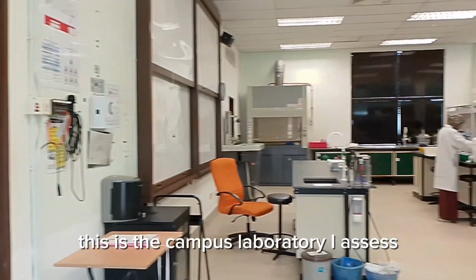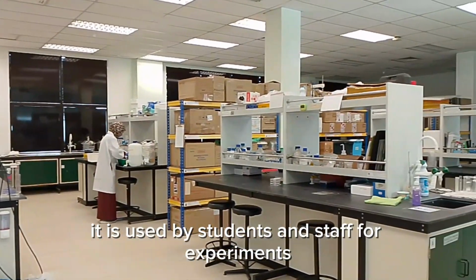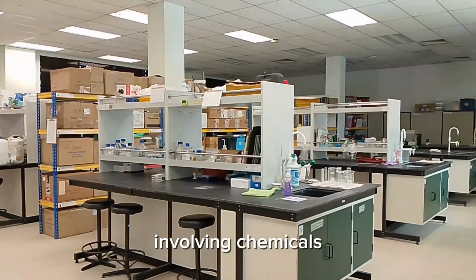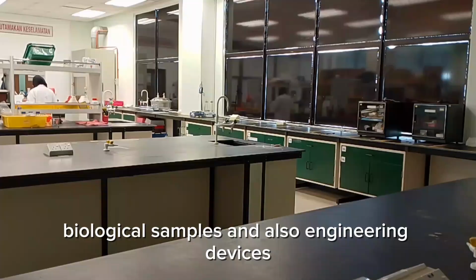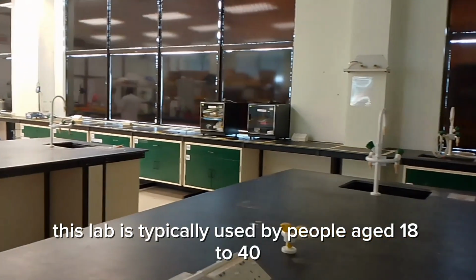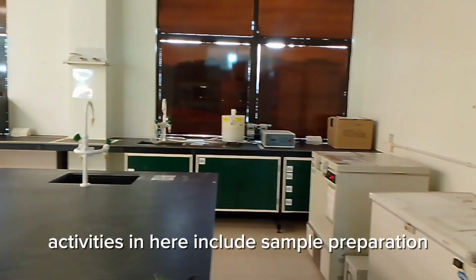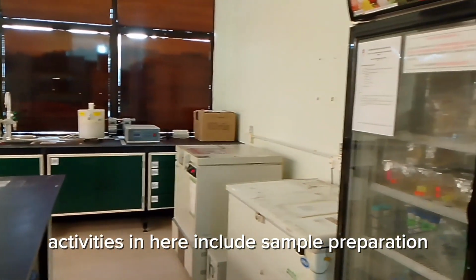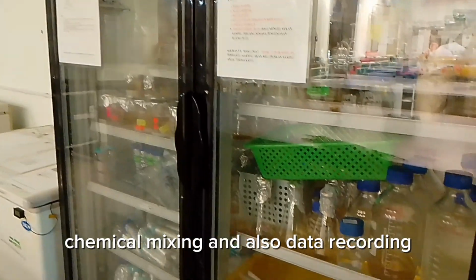This is the campus laboratory I assessed. It is used by students and staff for experiments involving chemicals, biological samples, and also engineering devices. This lab is typically used by people aged 18 to 40, mostly students and also lecturers. Activities in here include sample preparation, chemical mixing, and also data recording.